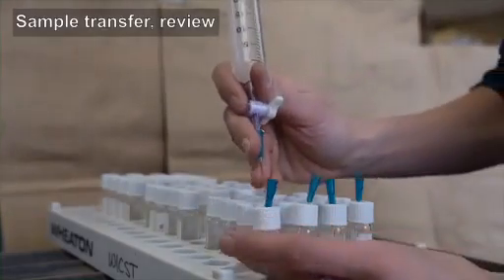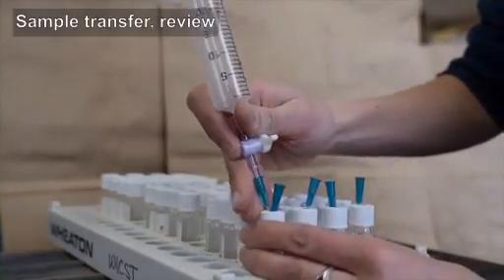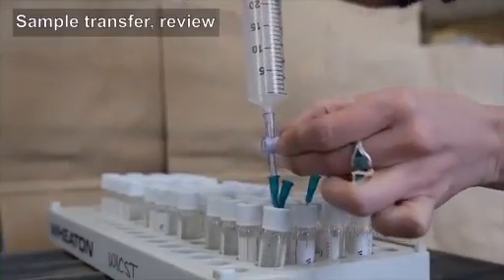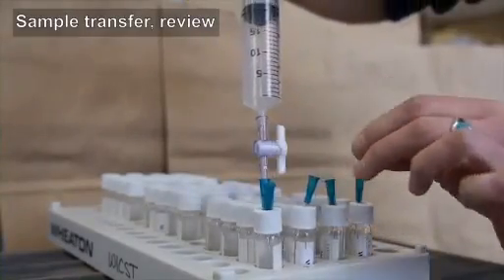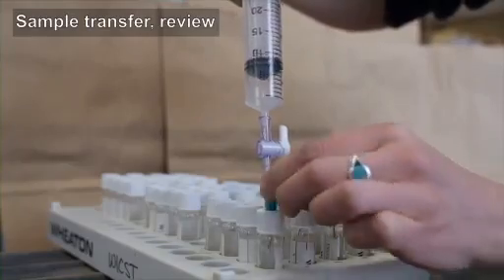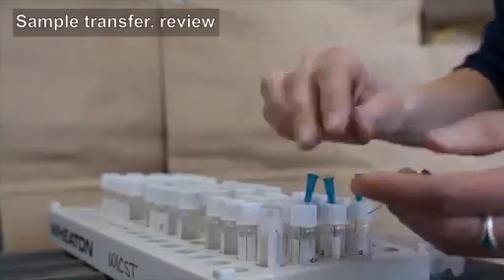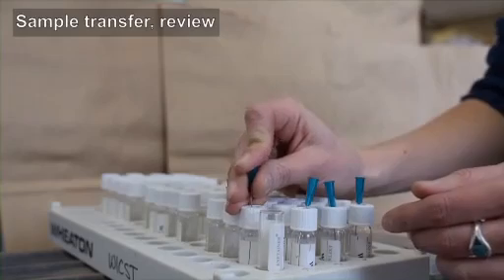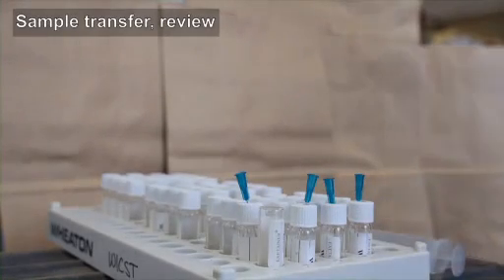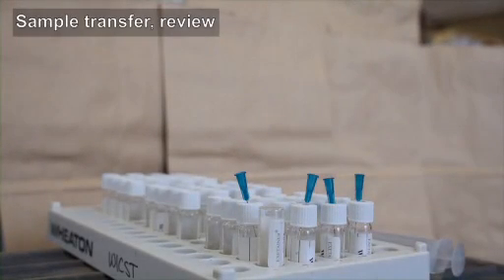In the flushing method of sample transfer shown here, initial sample injection results in the vial's previous contents being cleared through the extra needle, then when the extra needle is removed, the vial is filled to a positive pressure with sample. As an alternate to the flushing method, samples may instead be loaded into pre-evacuated or non-evacuated vials.